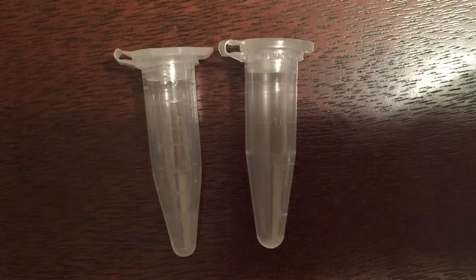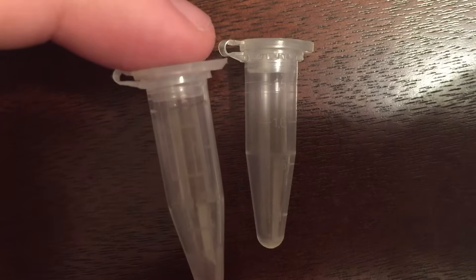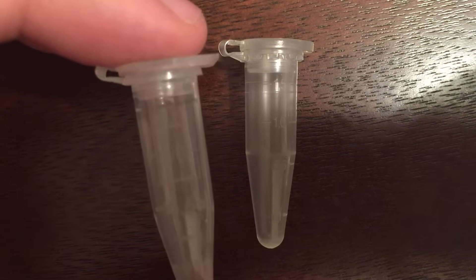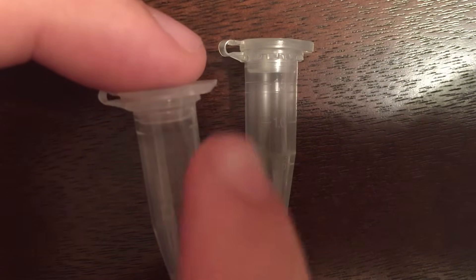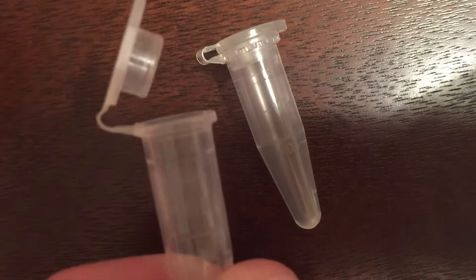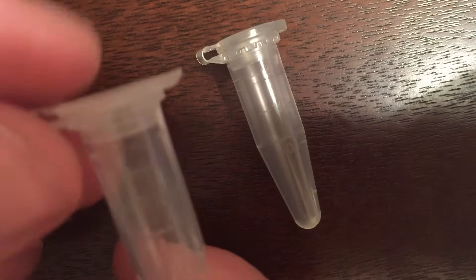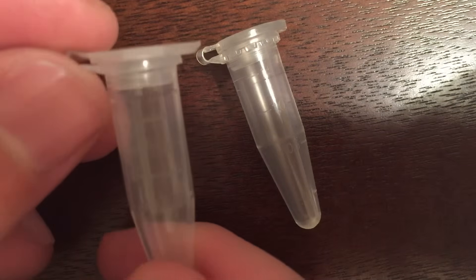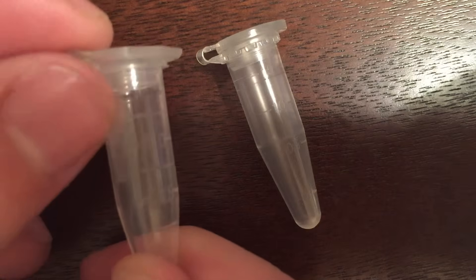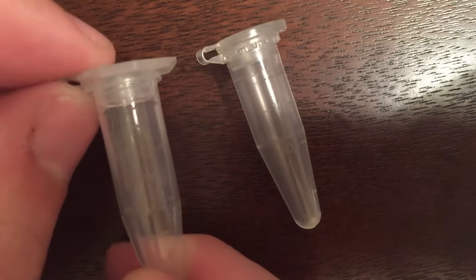If your sample is near that volume and you put it in the 1.5 milliliter tube, the meniscus will be right at the graduation mark and the liquid is going to be touching the side of the cap. As the tube is opened and closed, fingers and gloves are going to contact the liquid, and depending on how they're handled, this can be a serious source of contamination. If you have a sensitive sample, make sure you have enough room so it's not coming into contact with the cap.